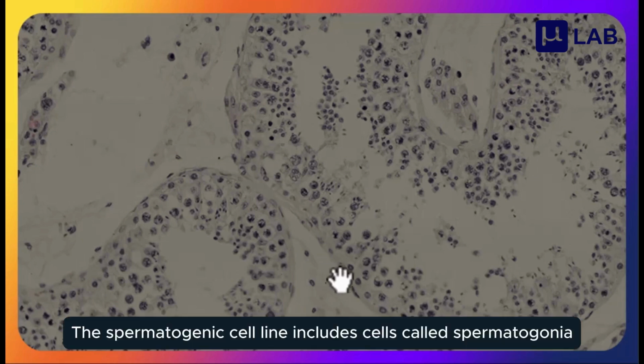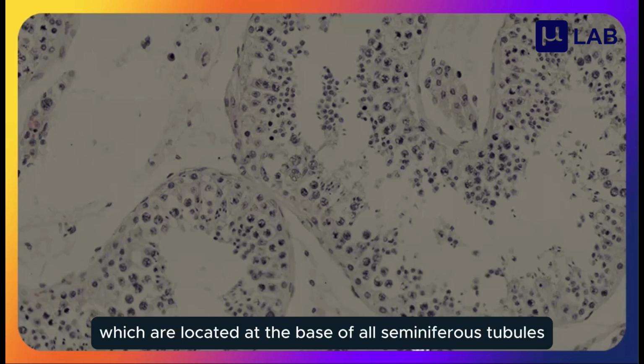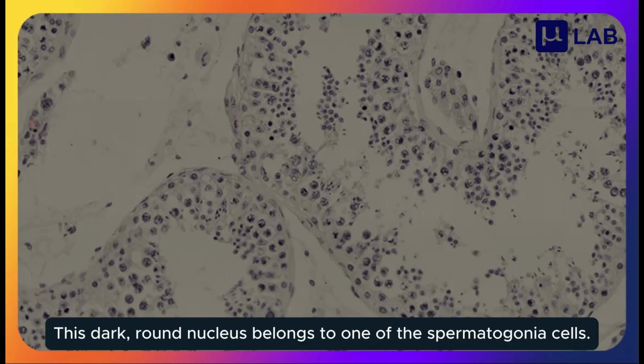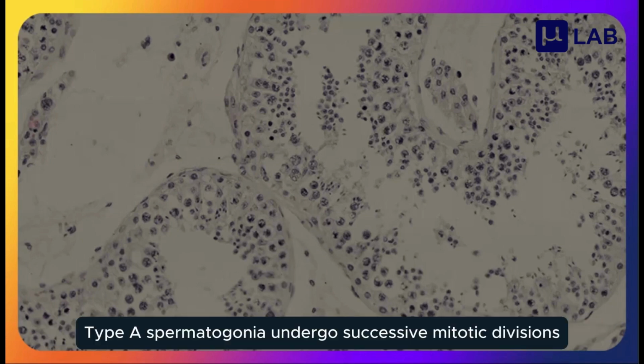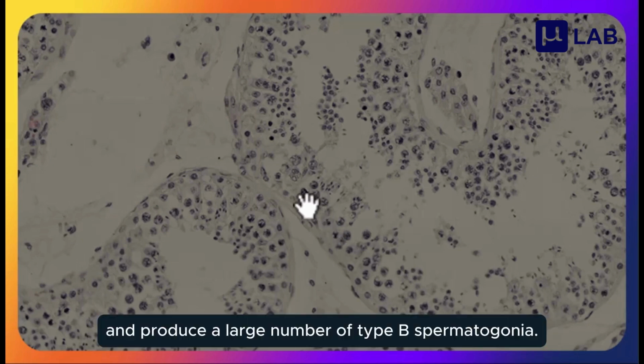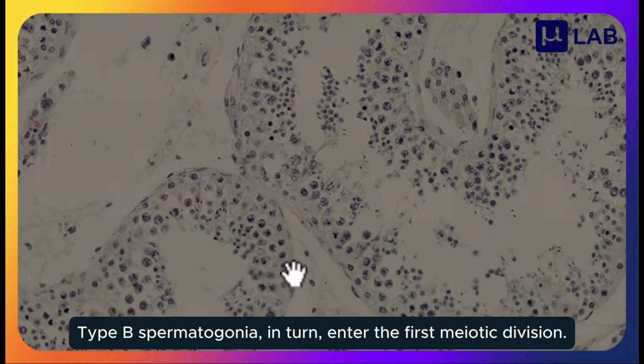The spermatogenic cell line includes cells called spermatogonia, which are located at the base of all seminiferous tubules. This dark, round nucleus belongs to one of the spermatogonia cells. Spermatogonia are of two types, type A spermatogonia and type B. Type A spermatogonia undergo successive mitotic divisions and produce a large number of type B spermatogonia. Type B spermatogonia, in turn, enter the first meiotic division.